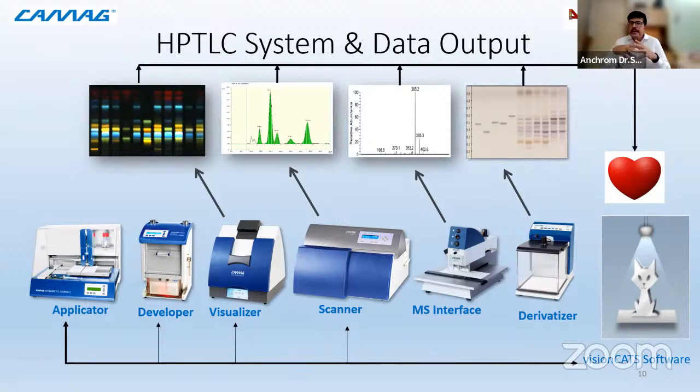I take a derivatizing reagent, which is normally a chemical mixture. I either spray it or dip the plate into it. These are the two popular techniques which are being used. And then you just dry the plate and heat it in a plate heater. The plate heater will speed up the reaction, and slowly you can see the spots. The last example which you are seeing above the derivatizer is the image which has been derivatized, and what it does is now your molecules become visible.